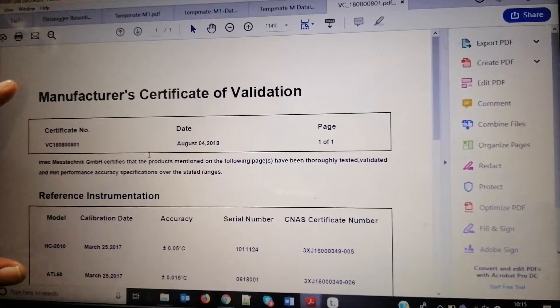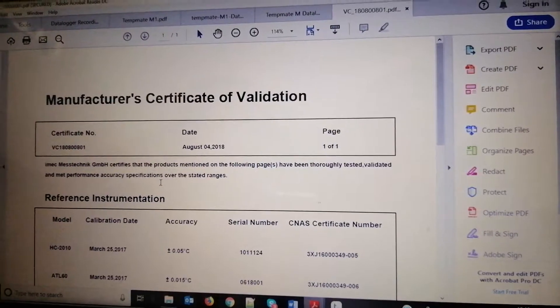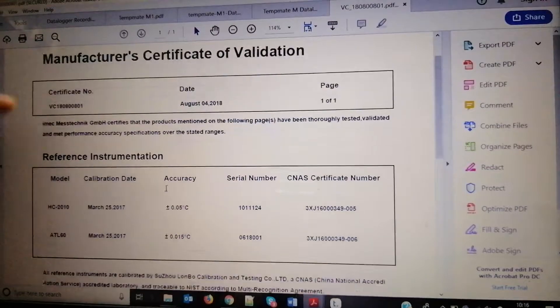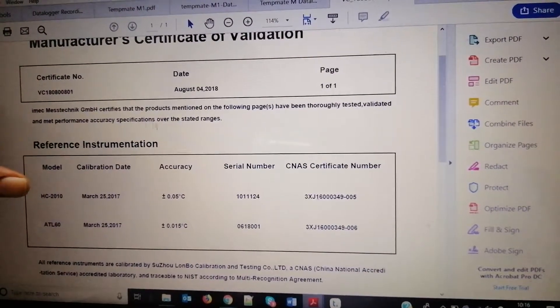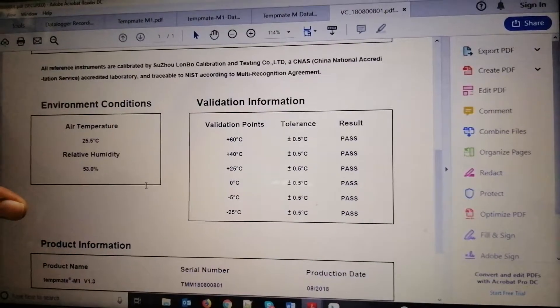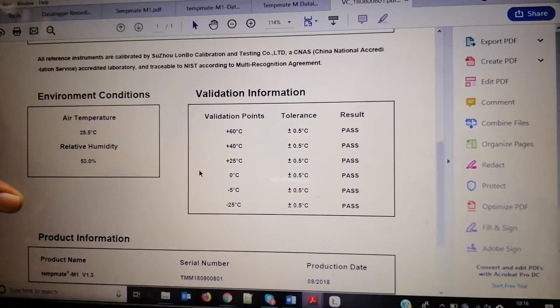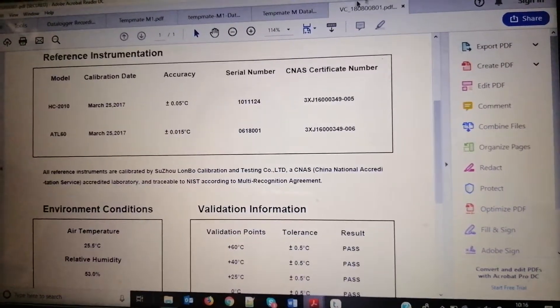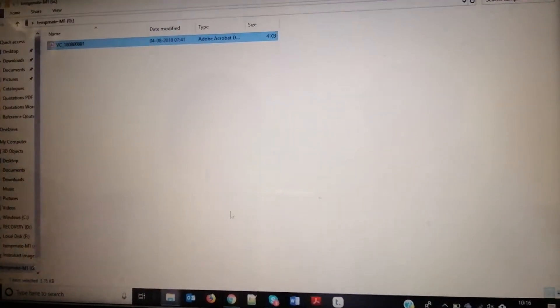This is the certificate validation which is automatically generated as a PDF. This is the reference instrument and the serial certificate number. This is the six-point validation information of this data logger along with the serial number and enrollment conditions — it is a calibration certificate.